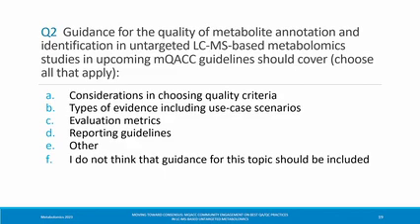Good morning, everybody. My name's Arpana Vania, and in the Fiehn Lab, I'm considered the librarian. It's a good question. When we're building libraries, we usually use mixes of standards purchased from different vendors. We usually have about 20, maybe 25 standards, and we run them normally at a 1 ppm concentration, because that's when we see good enough signals to get really good MSMS data quality.